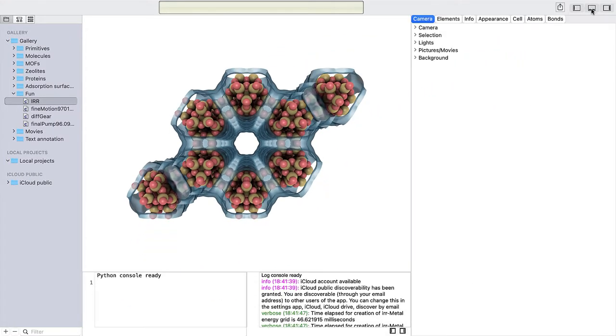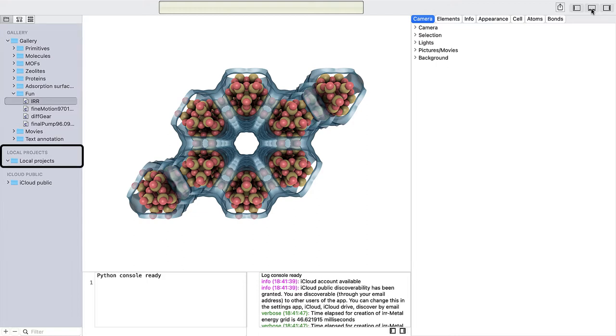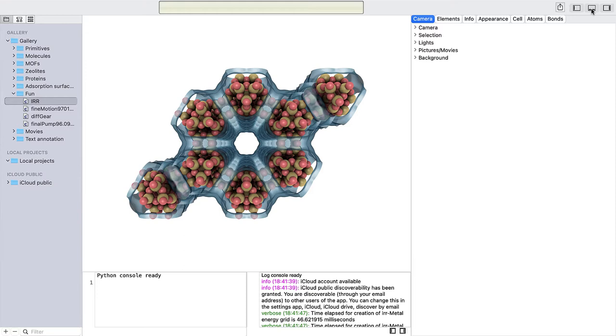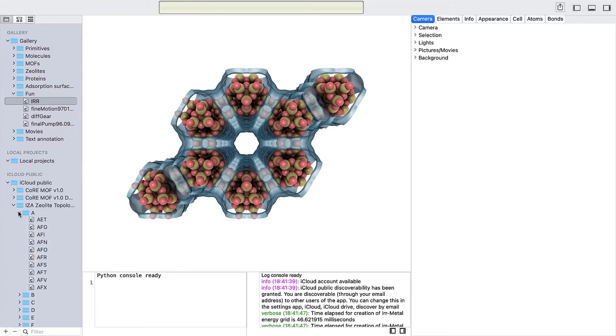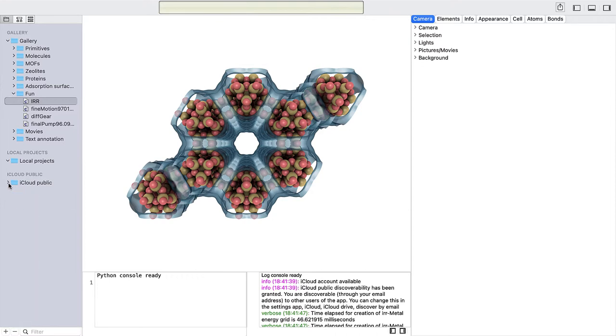The project navigator has three sections: Gallery, Local Projects, and iCloud Public. The Gallery contains some examples to play around with. In Local Projects, you can put your own projects with editing capability, and the iCloud part contains cloud store databases. The Gallery and cloud sections are immutable but can be dragged and dropped or copy-pasted to your local project section, after which they can be edited for content and appearance.